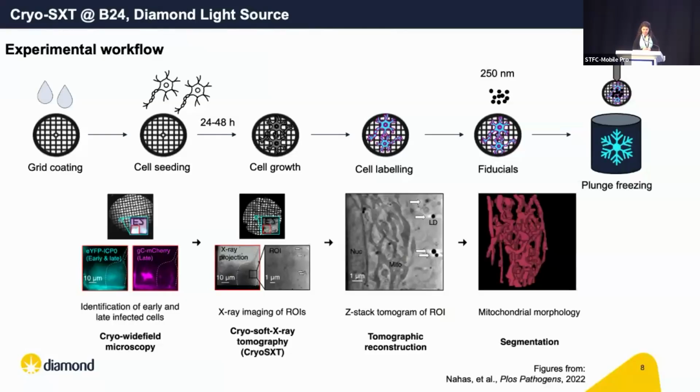After we provided the Z-stack of the tomograms reconstructed to the users, we can also move forward with providing some advice about the interpretation of the data and the reconstruction of the data themselves.